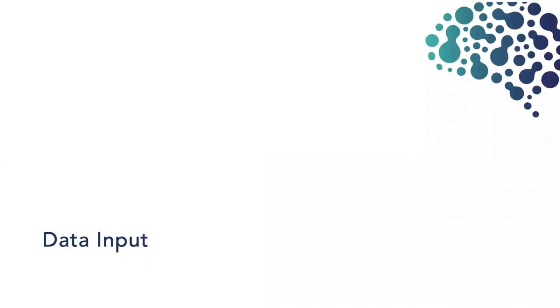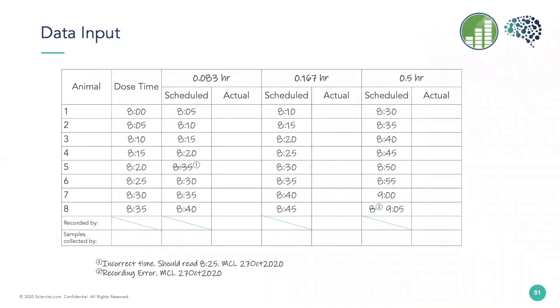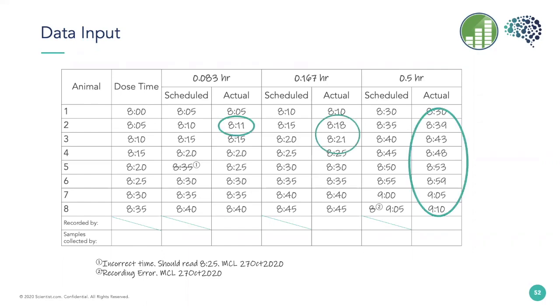So our next and our final challenge is the data input. While the input is our focus, we also need to consider error as well. And obviously, I'm not a robot, so I made some mistakes when I was originally typing this out, as you can see here. I did the same thing when I was handwriting data. We called the notes we made for these deviations e-notes, which is short for electronic notes. And I was very, very good at writing e-notes. So what we would do is come back in and look at the footnotes that we have here.